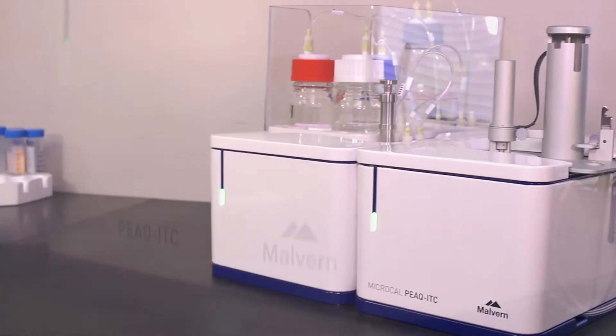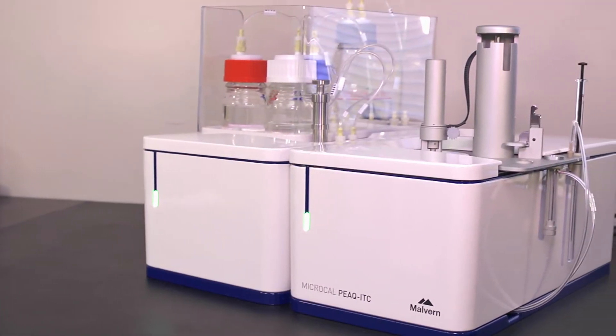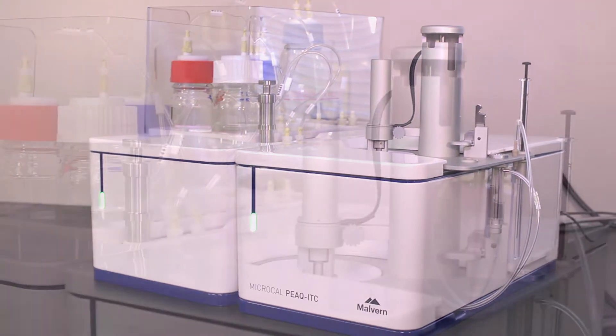Let me introduce you to the MicroCal PEAQ ITC from Malvern Instruments. It has a new ergonomic design and updated look and feel.